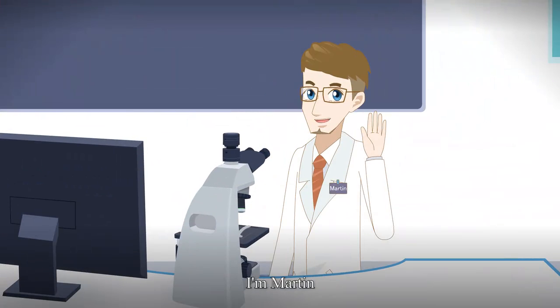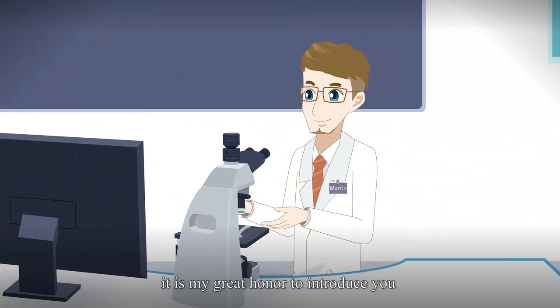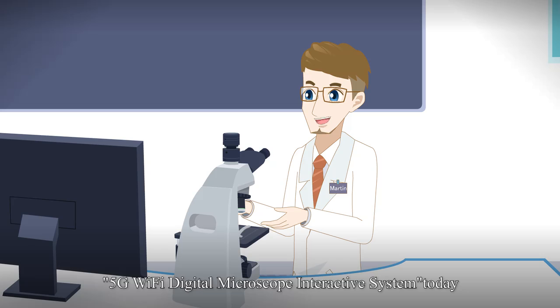Hello everyone, I'm Martin. It is my great honor to introduce you to the 5G Wi-Fi Digital Microscope Interactive System today.